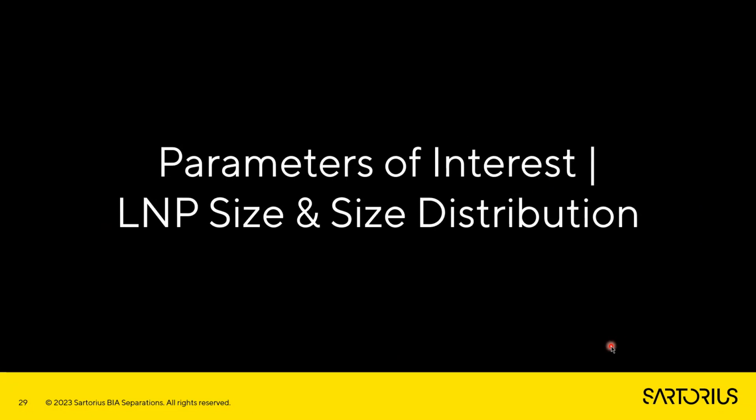So I want to go ahead to the second parameter of interest, which can be determined using our PATfix system, and that is LNP size and size distribution.